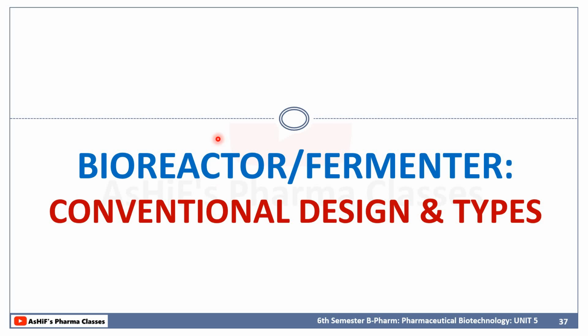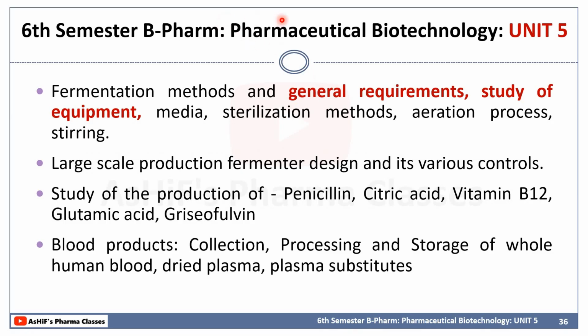So today in this session we are going to discuss the bioreactor or fermenter and its conventional design and different types of fermenters. This is an important topic from Unit 5 of Pharmaceutical Biotechnology of 6th semester B-Pharm. Here it is specified as a general requirement and study of equipment.